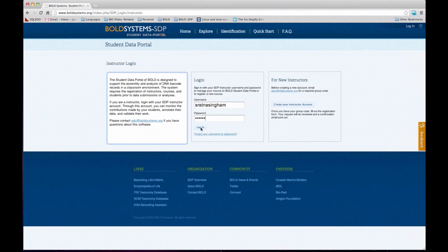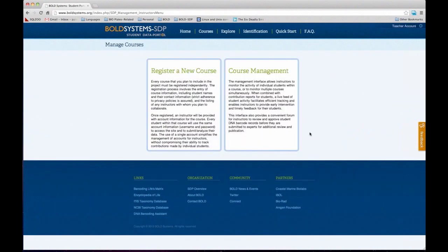I'm going to log in to create a new instructor account. Everyone at this point already has one, but it's fairly straightforward — you can just click Create a New Account. The only important thing to keep in mind is that you need to enter a group code to make sure you get an instructor account instead of a regular Bold account. Also, if you already have an account on Bold and you're having trouble creating a Bold STP account, it's likely because your email is already being used. We can transfer your Bold account into a Bold STP account if you request, or you may open a Bold STP account under a different email address.